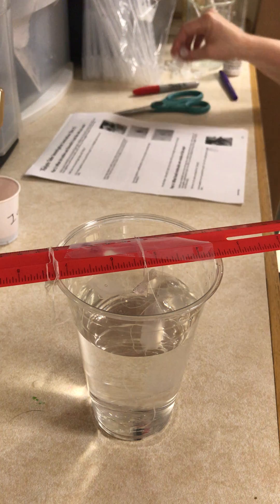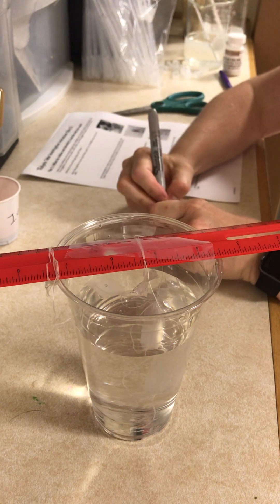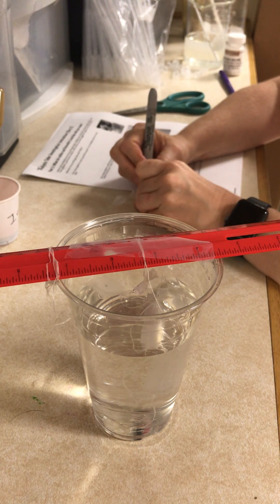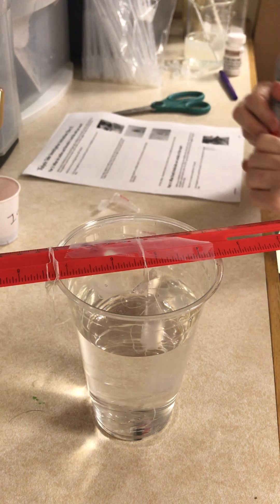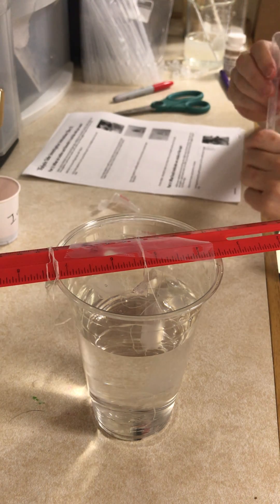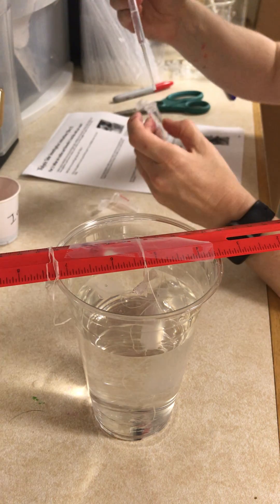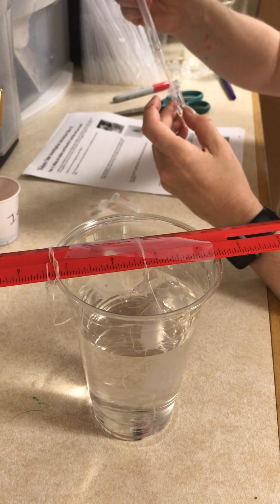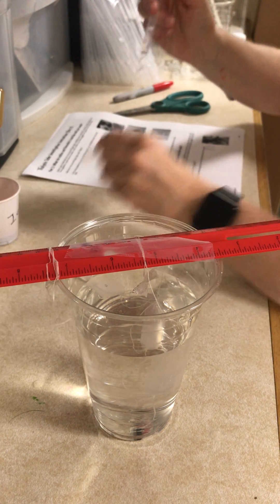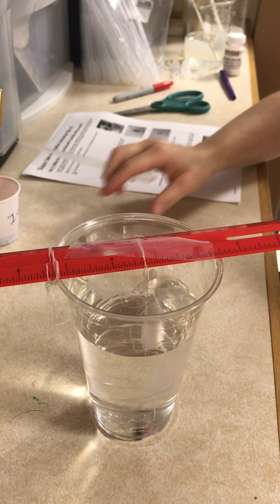I'm going to take two tubes and I'm going to label each of my tubes 'water.' Then I'm going to take a pipette and I'm going to add one milliliter of distilled water to each tube, cap it, and put it off to the side.